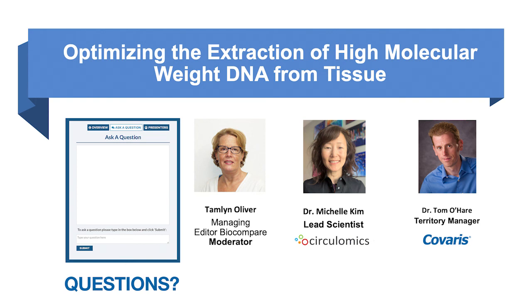All right. I will comment that the impact that is used with the cryoPREP is adjustable. So laboratories can write standard operating procedures with a particular impact for a particular tissue type and size, and that does help with reproducibility from user to user. Thank you. Next question is, do the short read eliminators damage the high molecular weight DNA?